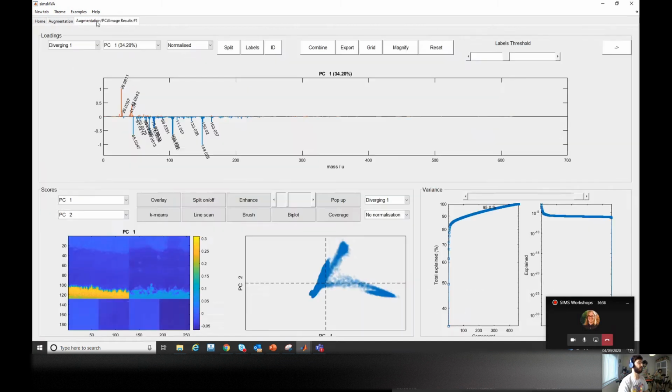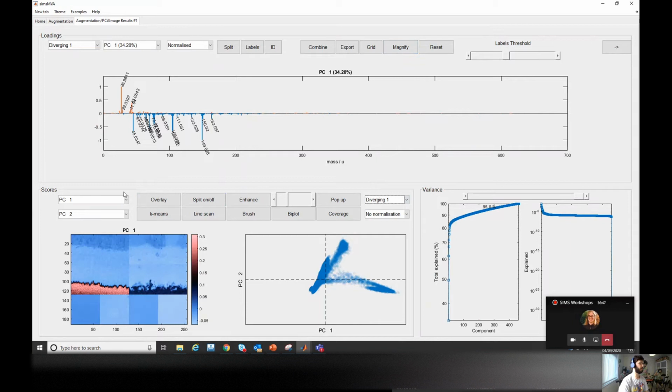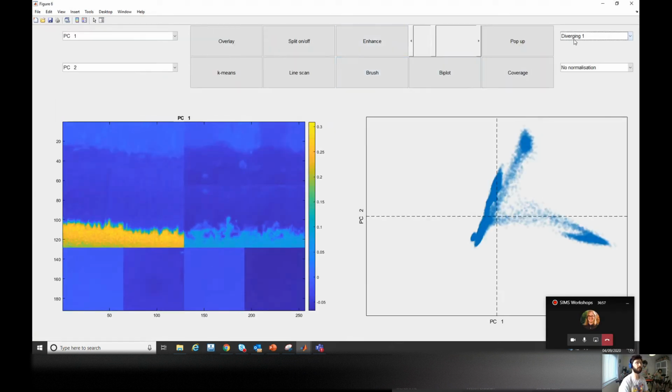Let's have a look at the results. So you can see here, let's focus on the scores.